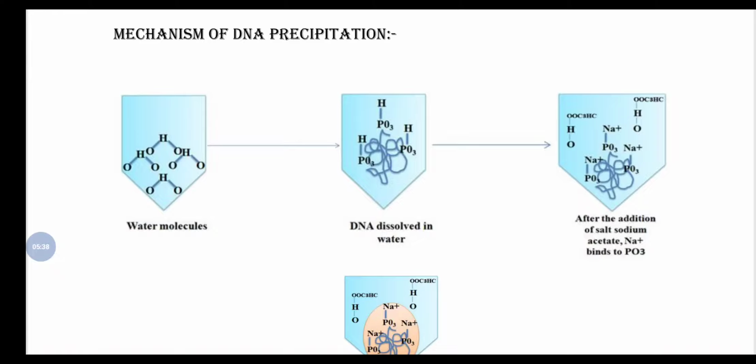Now, alcohol along with some salts, like sodium chloride and ammonium acetate, we can use those salts and precipitate the DNA into a visible solid form, which is a thread-like structure, we know.